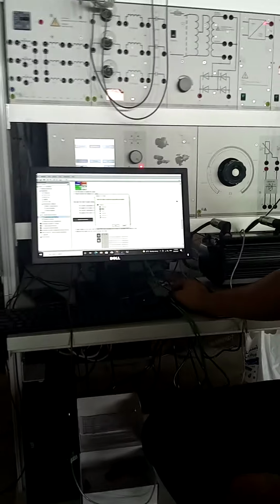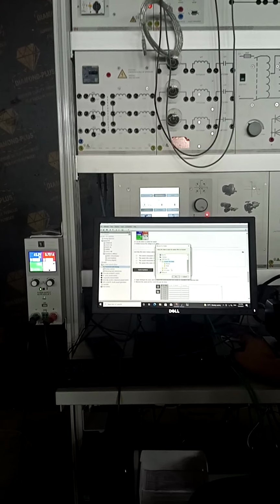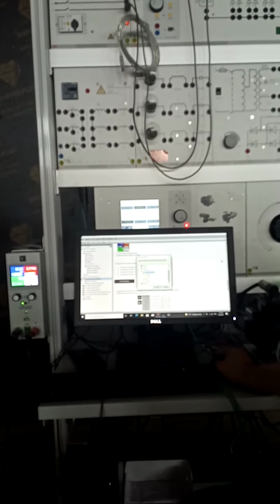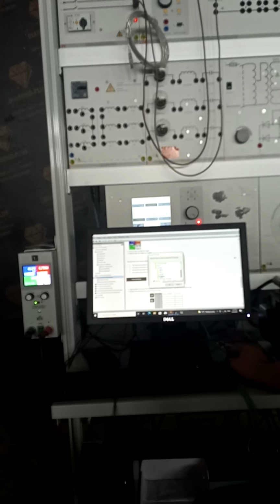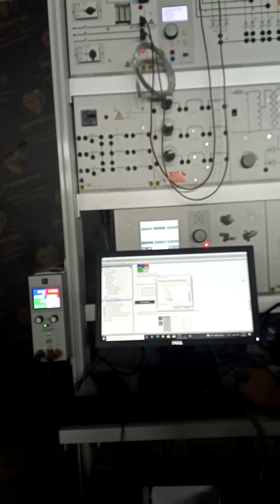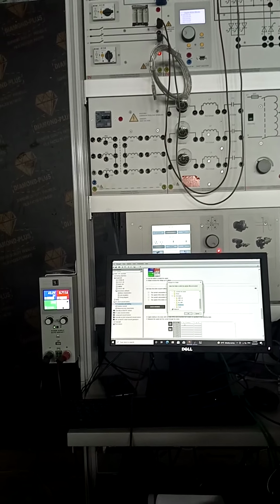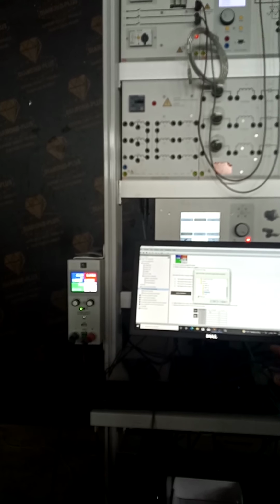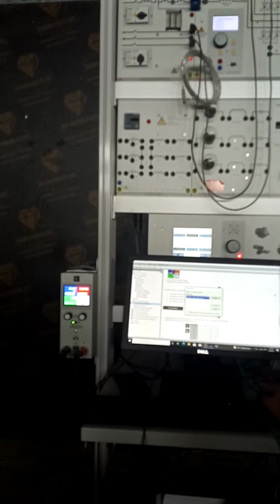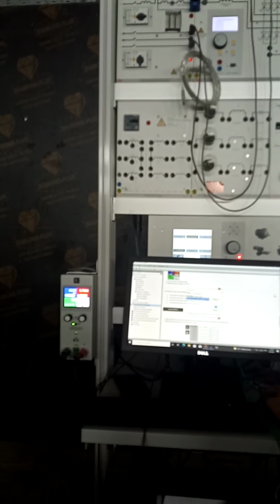Then you can go to the drive, and then you have courses, and then you have solutions. This USB I prepared for you. There is the course inside, the driver, everything, and solutions. If I click here for solutions, then I can see here the machine course.